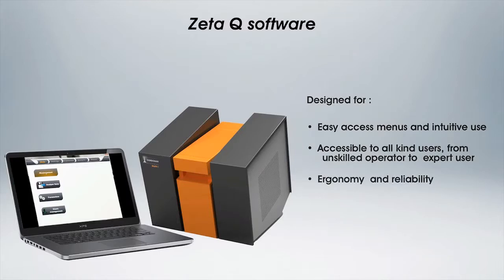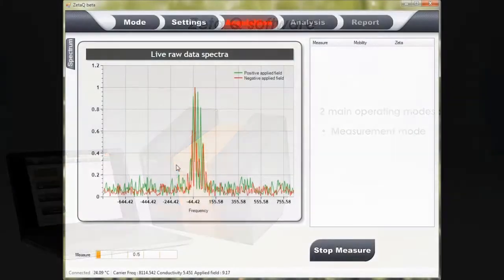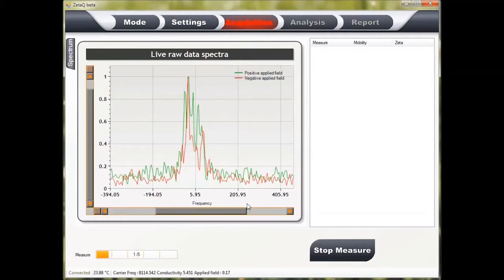Zeta-Q proposes two main operating modes. The measurement mode allows starting a measurement in few clicks, either in a continuous way or in a multi-acquisition session for size kinetic study.